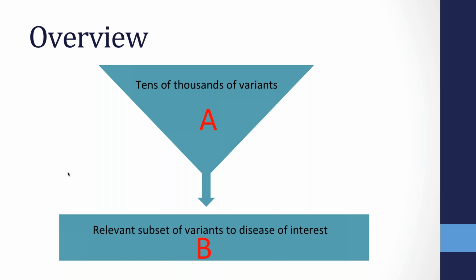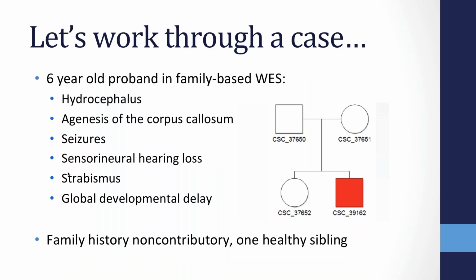And you know, there are several software tools that can use the VCF file as an input, and they compare that information against a large collection of annotation databases that will associate a variant with some type of function, a process, a pathway, or a disease itself. And so today what we're going to do is review some of the guidelines, the tools, and the resources that can identify variants with a potential association to the phenotype that you're studying.